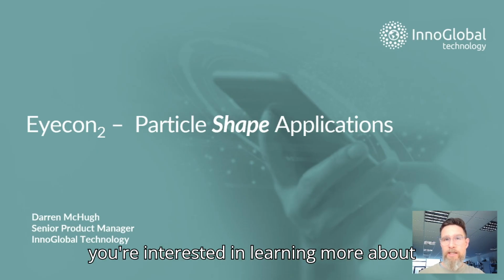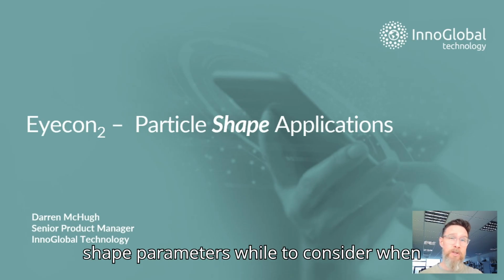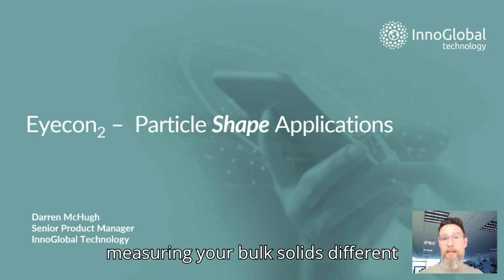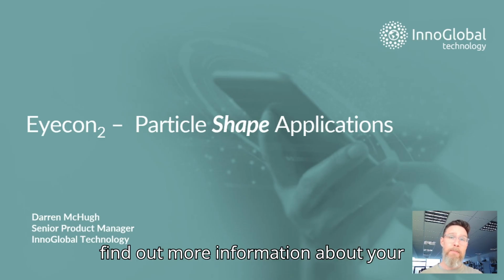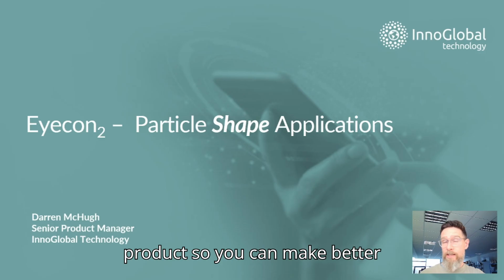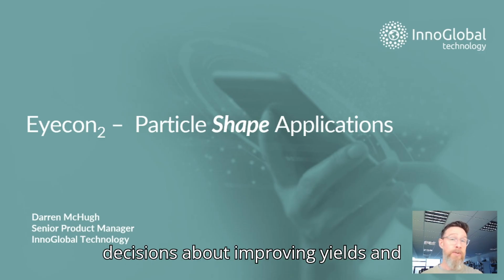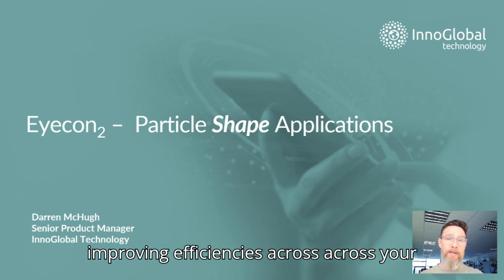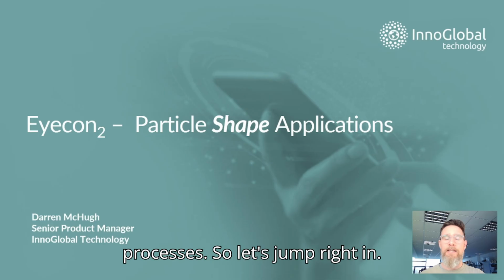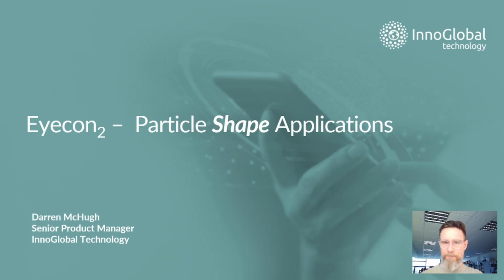This would be a good presentation if you're interested in learning more about shape parameters, what to consider when measuring your bulk solids, and different applications that this can be applied to, to find out more information about your product so you can make better decisions about improving yield, reducing content uniformity, and overall improving efficiencies across your processes. So let's jump right in.